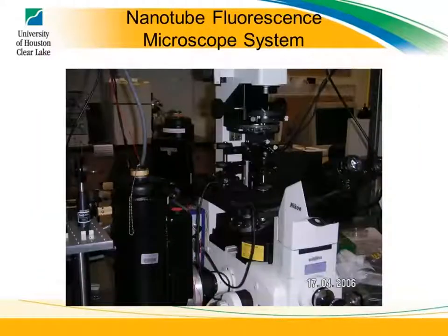It's pretty neat. So here's the nanotube fluorescence microscope system. That's that right. It's an inverted microscope, a Nikon microscope. You make sure you do not look through it when you have lasers exciting nanotubes on there.